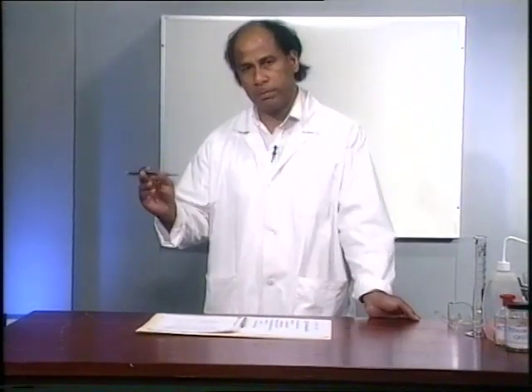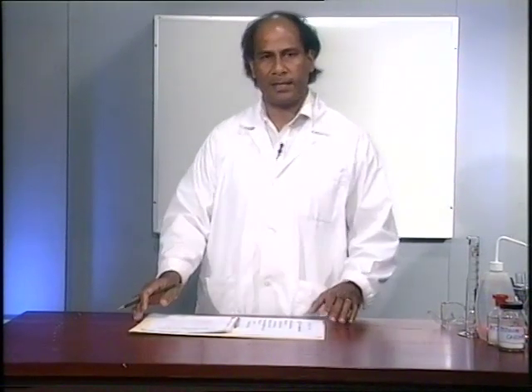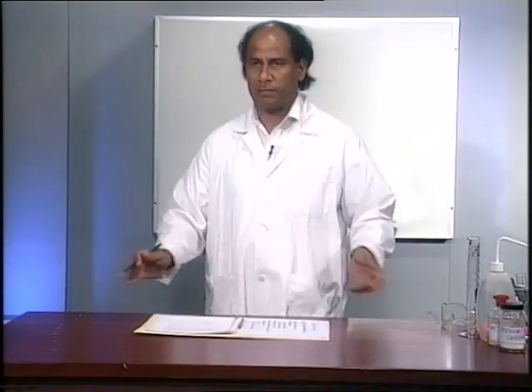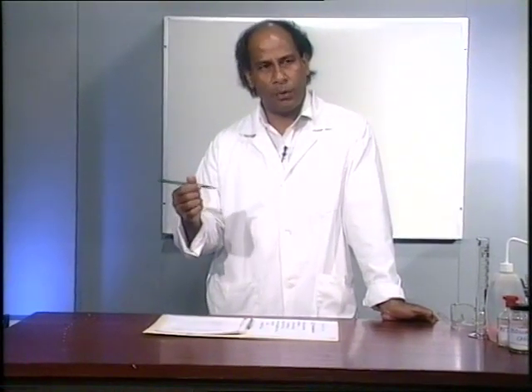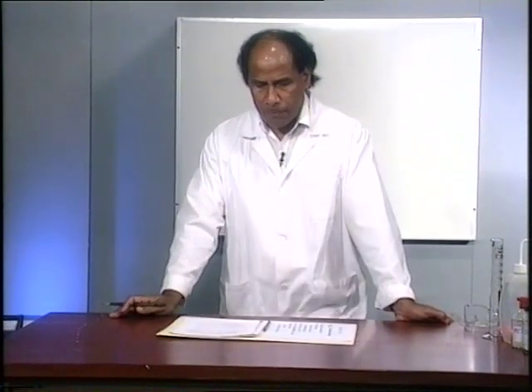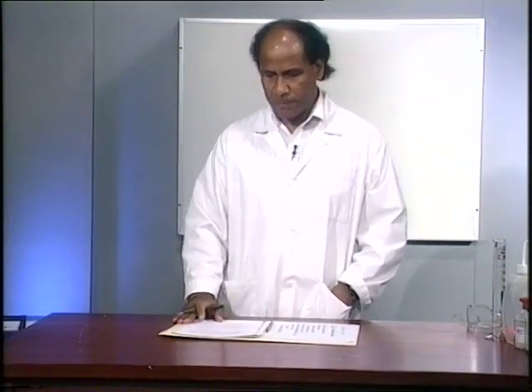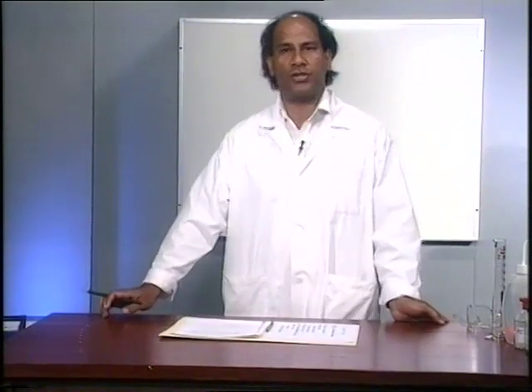In this experiment, you're going to be looking at this hydrogen bonding, the last type of intermolecular attraction that we've considered. And so we go through the procedure as given in your lab manuals. I'm just going to highlight some of the important things that you need to observe or to concentrate on, to emphasize. So the first one, part one, unfortunately there is no title for that first part, but I've given it a title. You may like to put in that title as volume change on freezing.